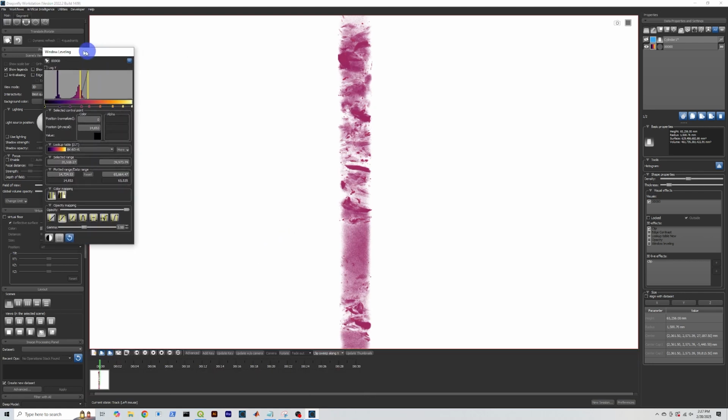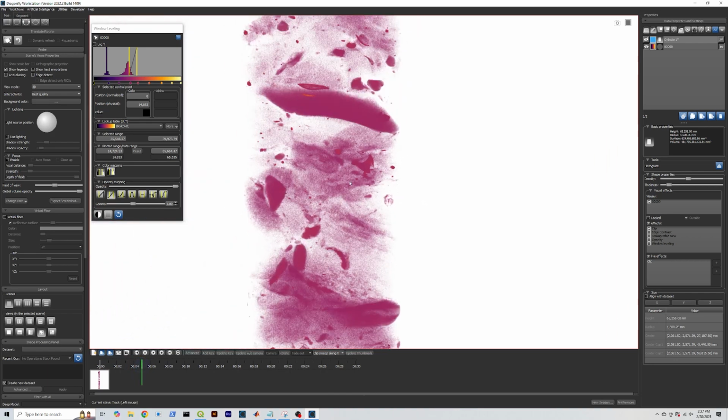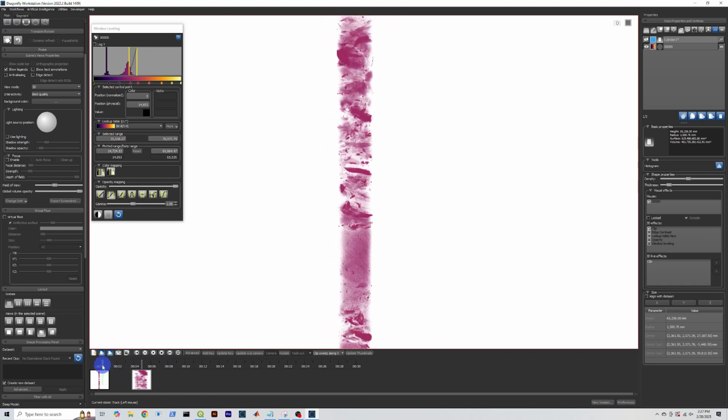And this basically works on the concept of keyframes, and I won't explain that here. It's a sort of a basic interpolation technique for three-dimensional objects. Basically, you have a timeline of a 30-second movie right here, and this green bar is like wherever you are in time in that movie. So let's select 5 seconds into the future, and let's zoom into and pan up to, let's see, ooh, look at that little shell right there. And then we're going to add a key. And what this does is it just linearly interpolates from point A to point B on your timeline here. So we can click and drag this time feature, and ooh, yeah, we can see that.